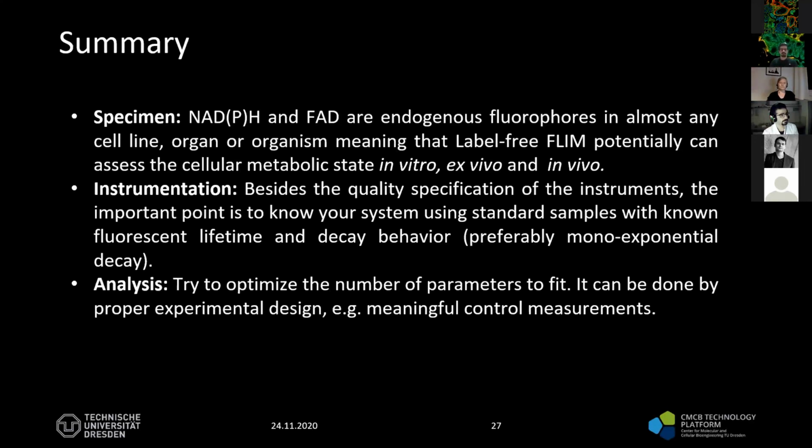And also the instrumentation, as I mentioned several times: besides the quality and specification of the instruments you are using, it is important that you know your system, you know the experiments you want to do with that system, and try to be consistent and optimal with the acquisition and analysis across the experiments you are doing.